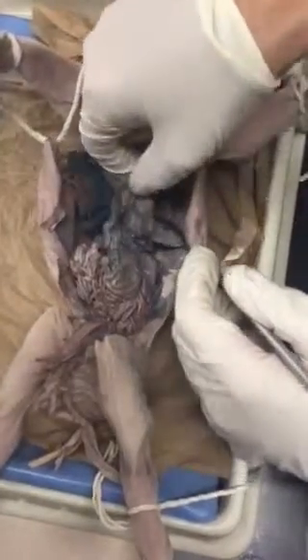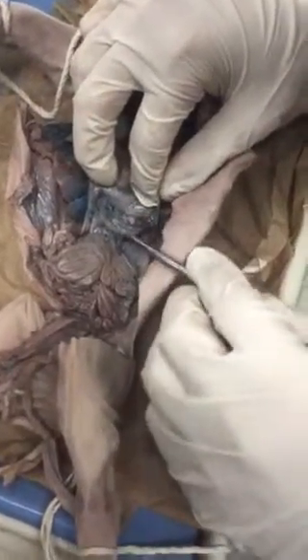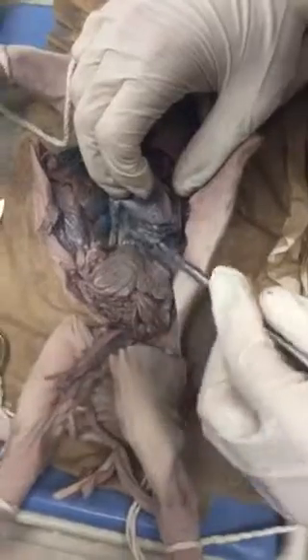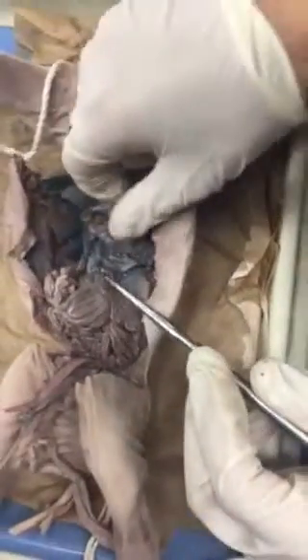And as we move that back, this might be a little hard to see. You have this slightly whitish thing that's under your stomach, and it's in between your stomach and big intestine, well, it's technically small intestine. And this little part right here is called your pancreas.